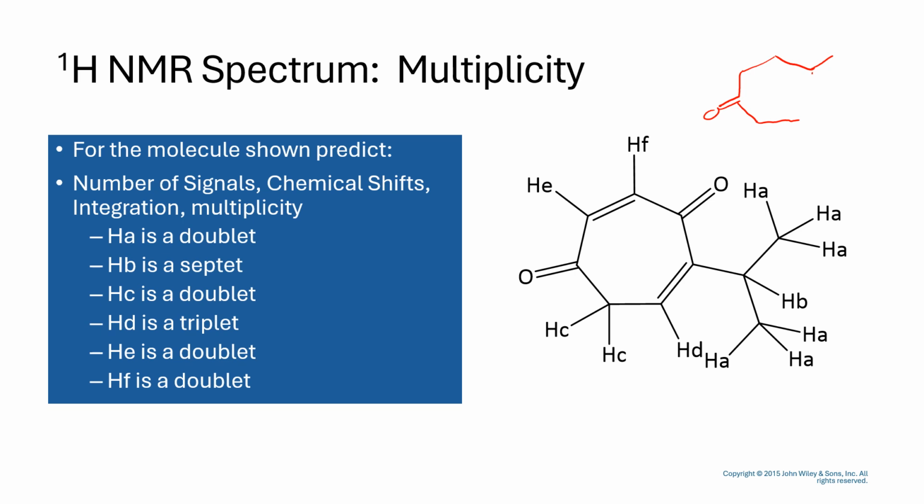I'm trying to draw in, not that easy here, but that. And that will be 2 methyls, and that's pretty much it. So if you see that, then you should be able to draw all the H's, which is what you have in the drawing. Now let's group. This is methyl, methyl, which is this.